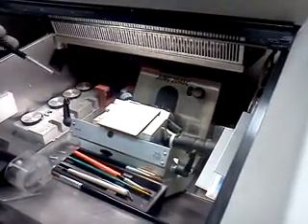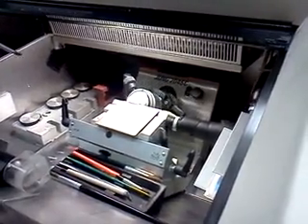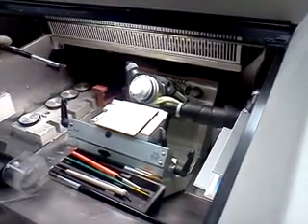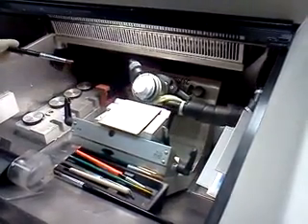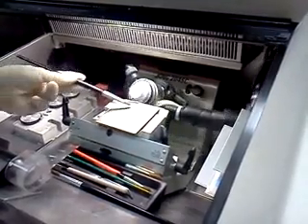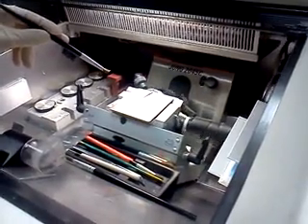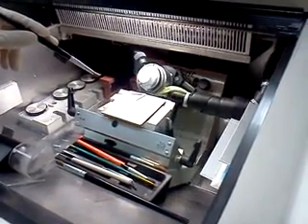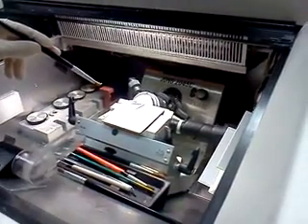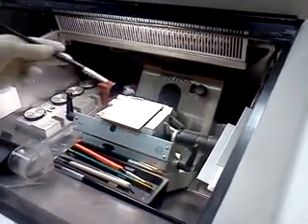Now we have it at minus 28, minus 23. I hope it's a good temperature, but it might be too warm, or it might be too cold, I don't know. Okay, when we finally get to a point where we're happy with it, then we're going to start collecting the sections. But right now, this would be on this slide, but this wouldn't. And if this was real tissue, this would be horrible, wasting all that tissue, but since we're practicing, we won't worry.